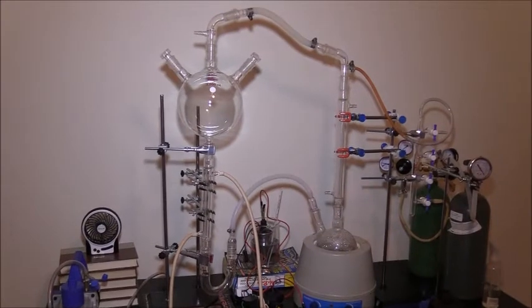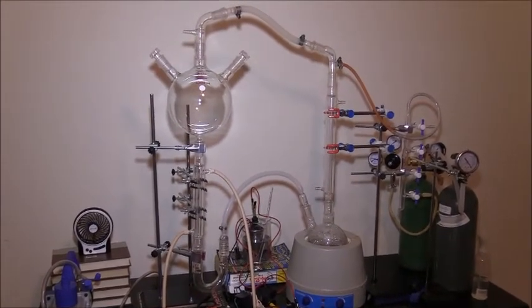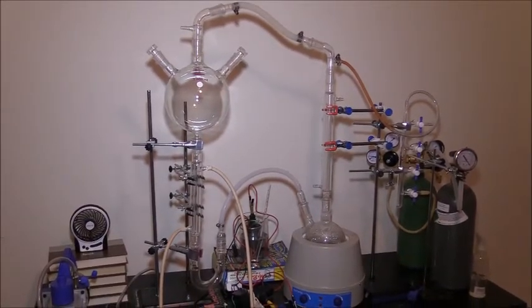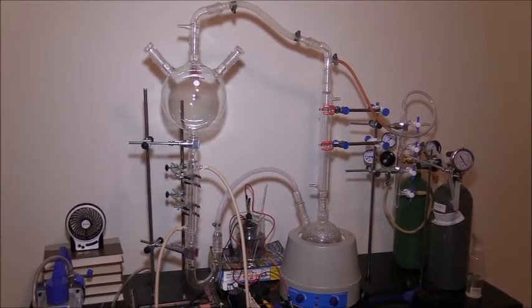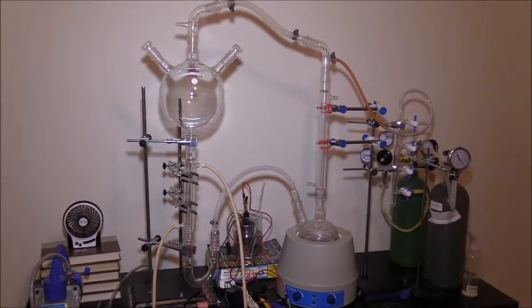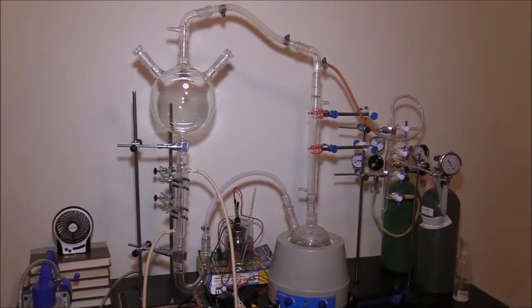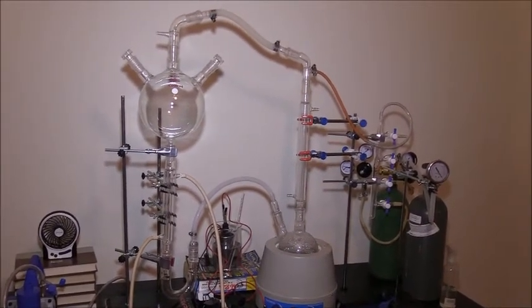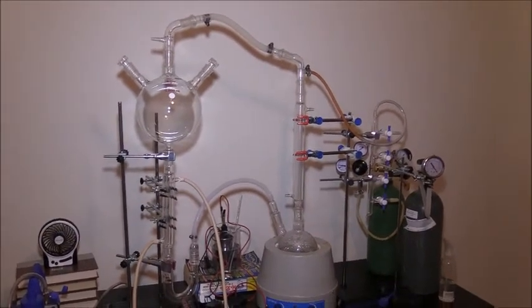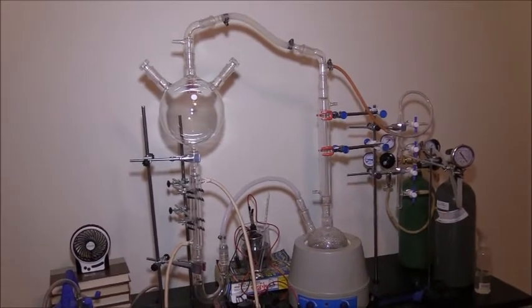Hello YouTube! What you're looking at here is the new and improved version of my Miller-Urey apparatus. I decided to create a different design for the experiment after my electrode flask cracked and actually crashed to the ground and broke, so I decided to have a flask custom-made.